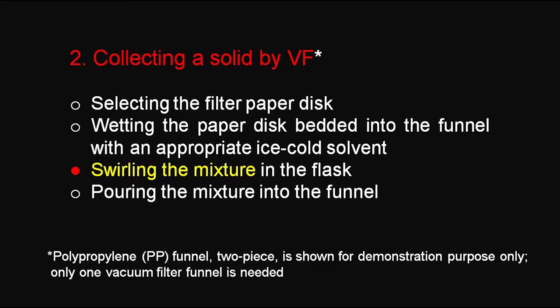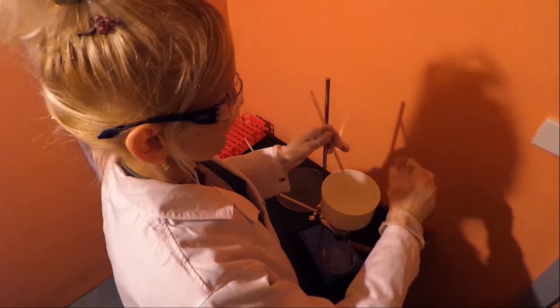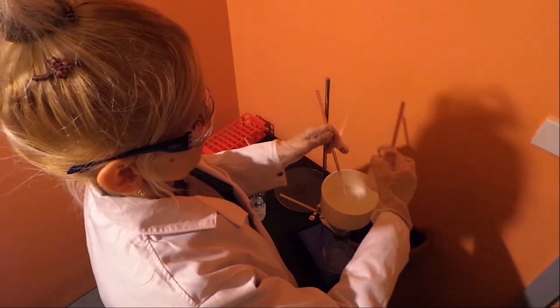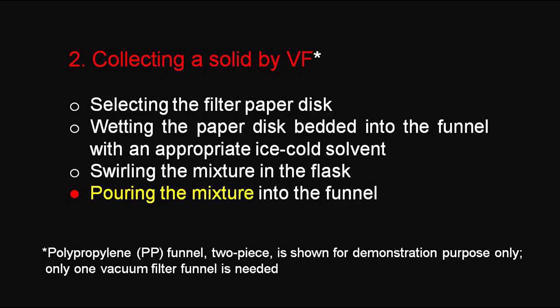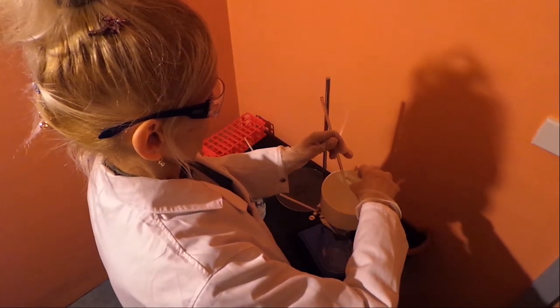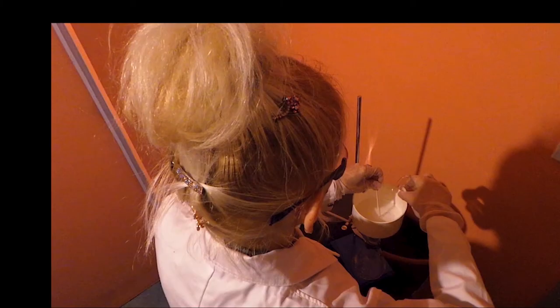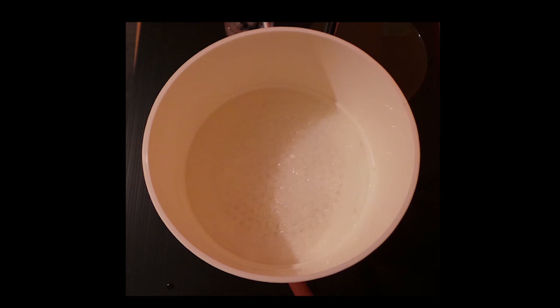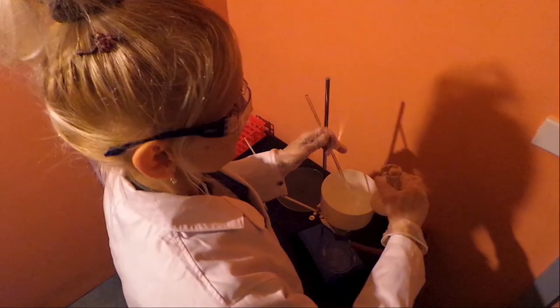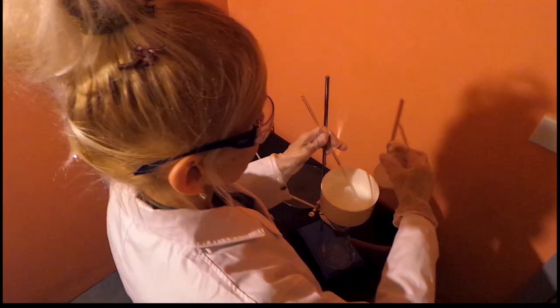Before the paper dries, we need to start adding the mixture. After swirling the mixture gently in the flask, pour the mixture down a clean glass rod into the center of the filter medium to prevent splashing and spillage, while applying only a light vacuum until a protective layer of solid has built up on top of the paper disk to prevent paper breakage. It is better to add the mixture in small portions rather than all at once, so we can avoid overfilling.